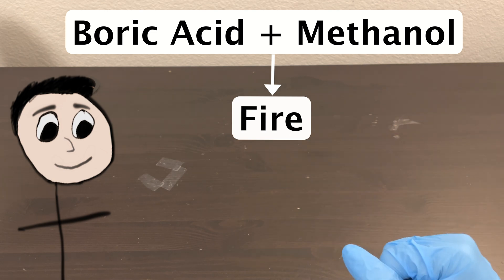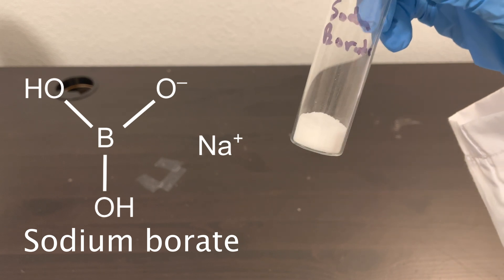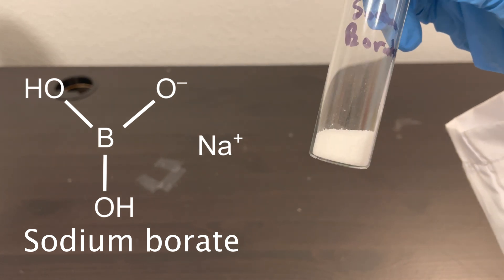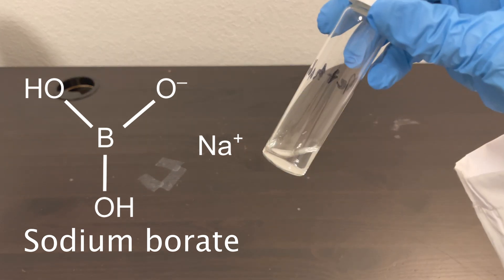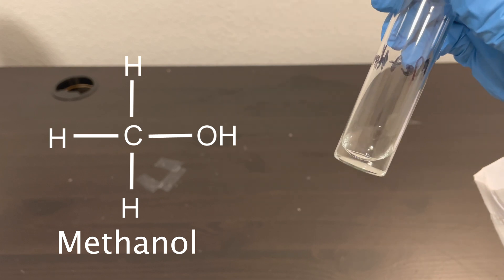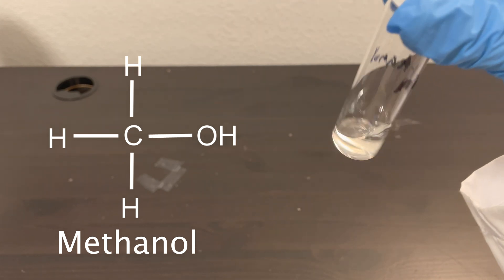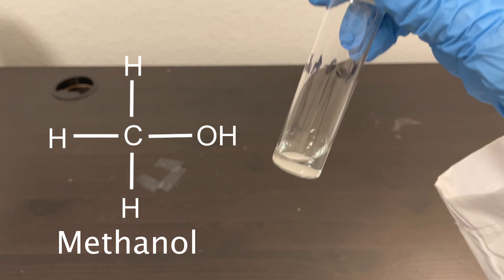I didn't have boric acid, but I did have sodium borate — the conjugate base of boric acid — so I figured that would work. I did have a very small amount of methanol, which is good, but I also wouldn't be able to create a lot of methanol borate solution. Hopefully it would still be enough to create some kind of flame though.